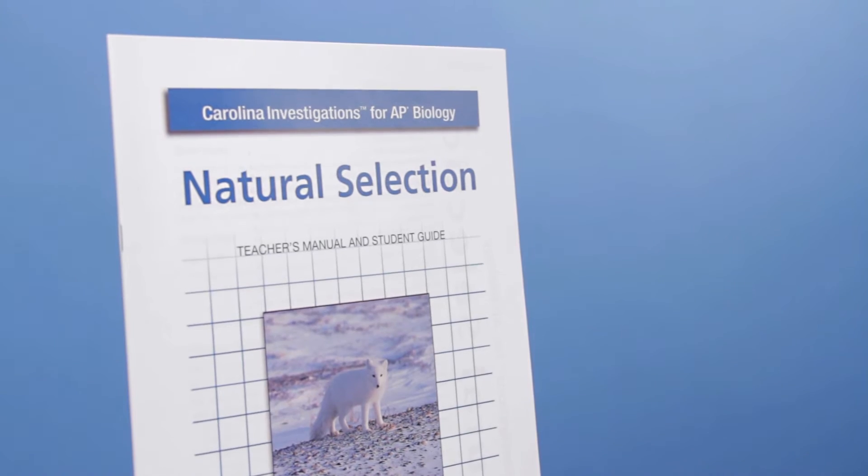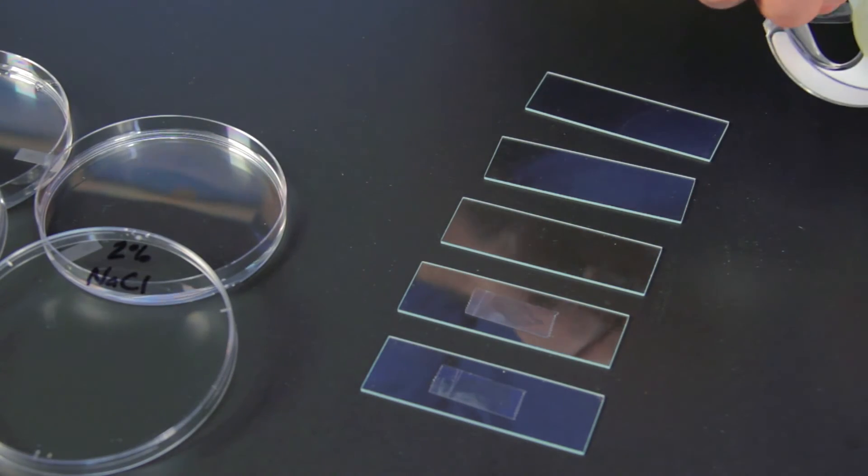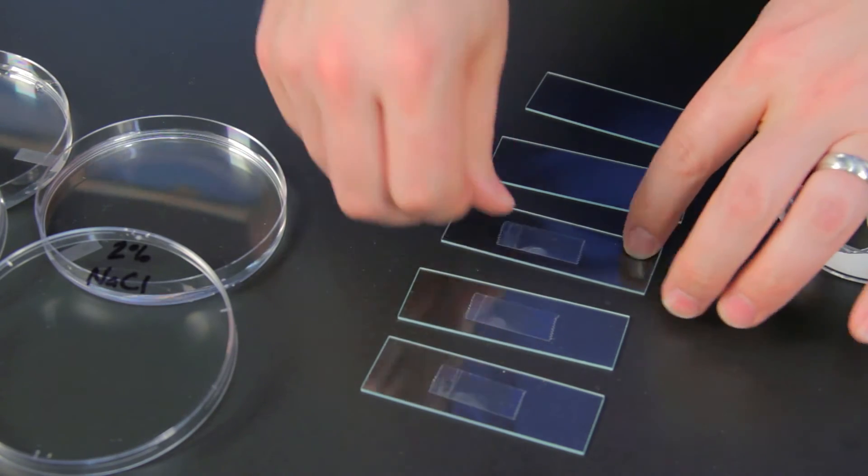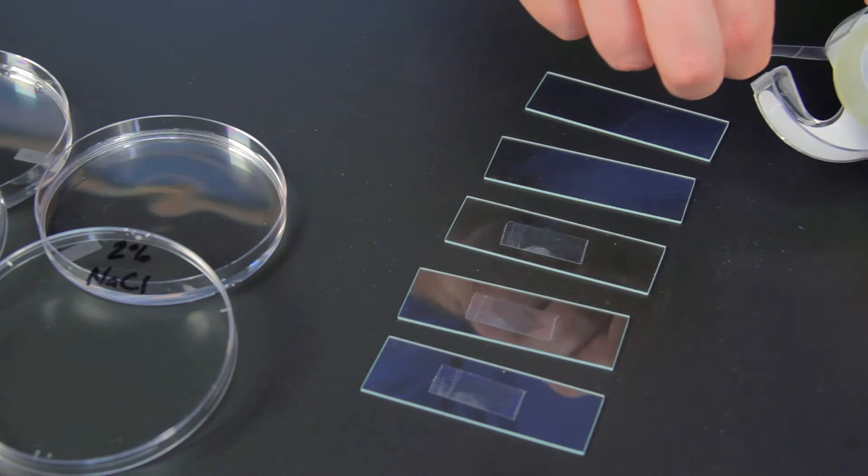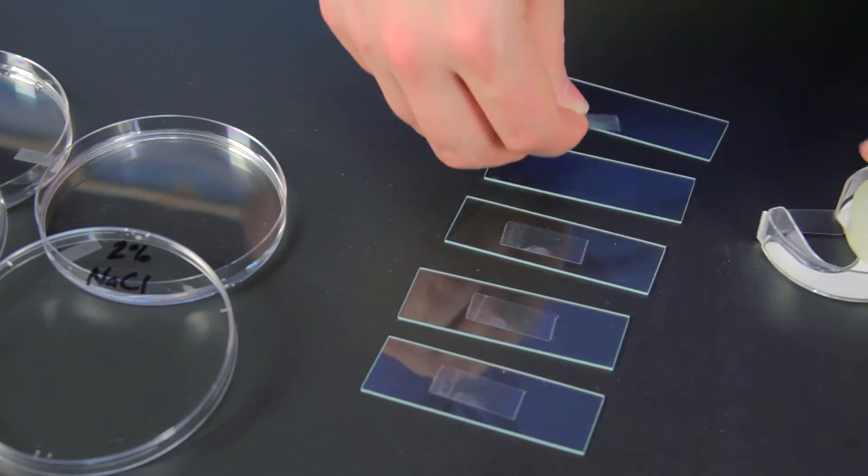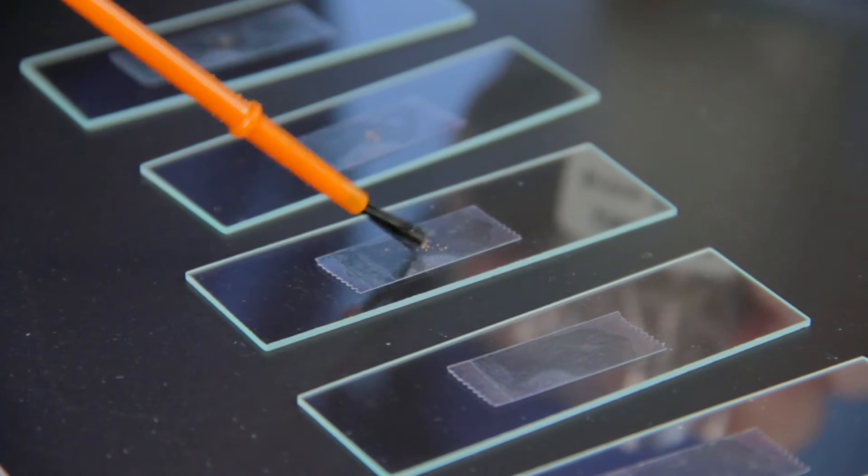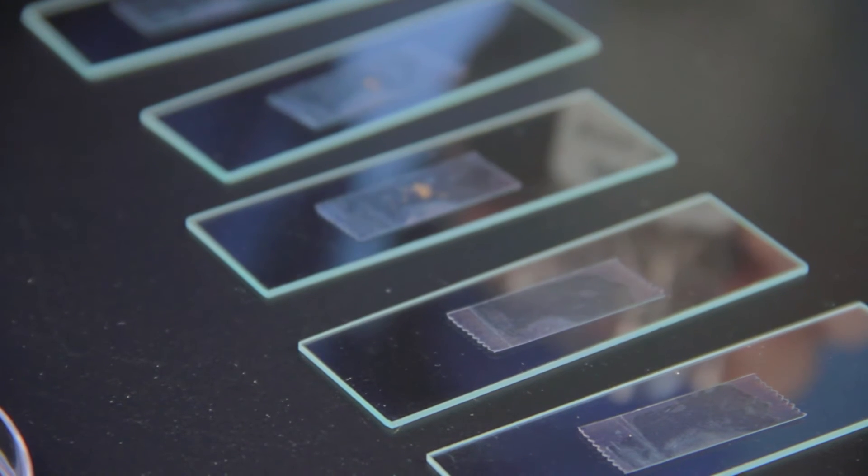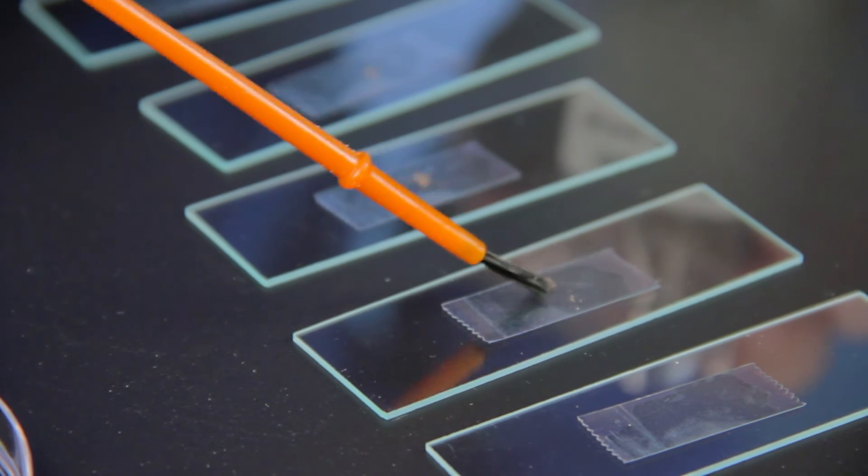Offering an inquiry-based approach to natural selection, students work with brine shrimp and assess hatching viability and survivability in a variety of conditions. In the initial guided activity, students learn about the effects of salinity concentrations on brine shrimp hatching before designing their own guided inquiry experiment.